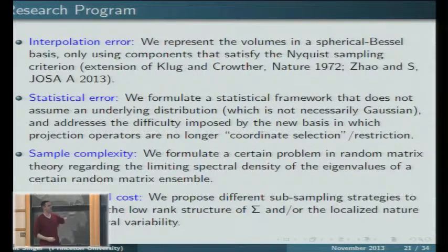So we have to address each of these limitations one at a time, and some of the solutions are going to apply to the other issues. For the interpolation error, we're going to throw out this Cartesian basis and represent our volumes in a different basis, so that we also agree with the Nyquist sampling criterion and so on. I'll get to it soon.